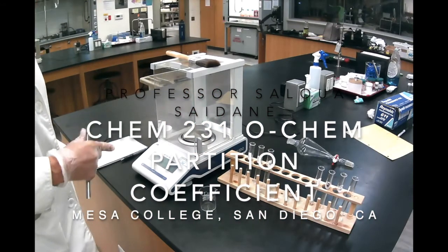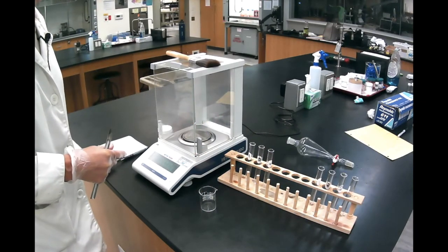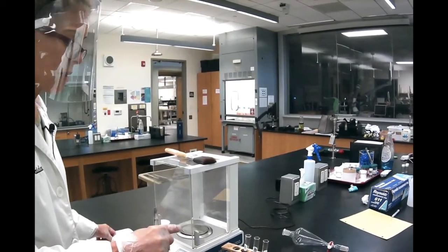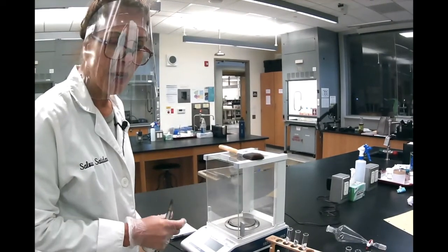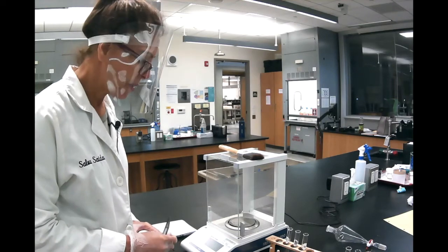So today we're going to do partition coefficient, and for partition coefficient your first step is you're going to put some substance, which is benzoic acid, in a test tube. You're going to weigh about 100 milligrams of benzoic acid.